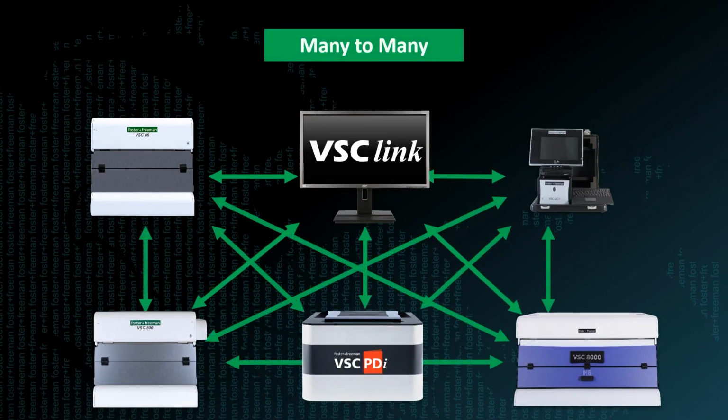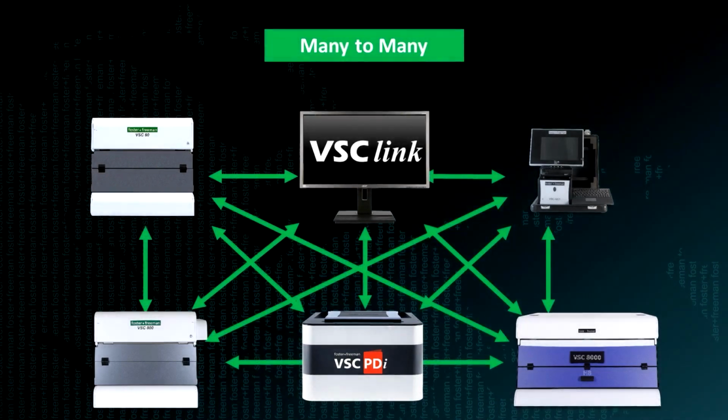Finally, you can have a network situation such as this, which is many to many. And using this type of network arrangement, users can not only send information back to the VSC Link, but they can also send information back to any other VSC workstation itself. So the information can go from anywhere to anywhere and flow in both directions.